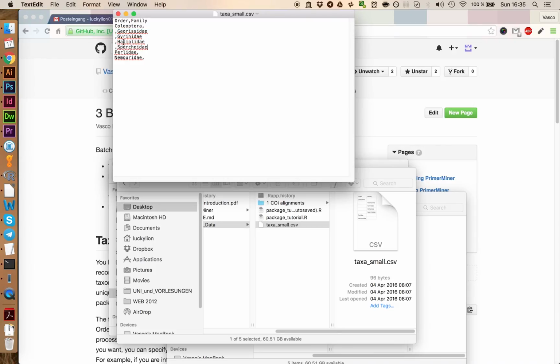There are of course some more aquatic families for Coleoptera, but in this case I'm just downloading a small subset for demonstration purposes. So we basically specify here the folder in which all the data should be loaded, but this is not downloading all Coleoptera, it downloads just everything which is here in the second family column.